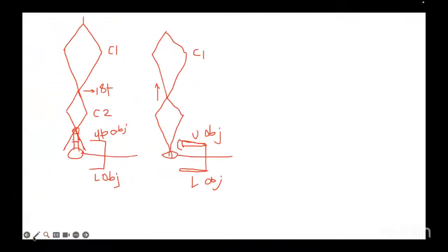Here, what we are trying to do is make the crossover point using the C2 lens in such a way that the electron beam converges just above the sample. If we enlarge this area, you can see the electron beam converges above the sample.